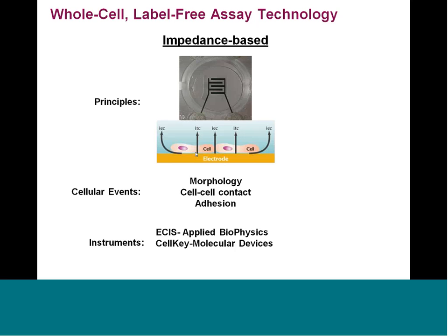But then it does something even more remarkable, and that is the trace that you see, that transformed trace from all of those frequencies, is processed in a way that the trace gives you a qualitative readout as to whether it is Gi, Gq, or Gs, which is really stunning. We've done a lot of work on that, but I won't show any of that today.